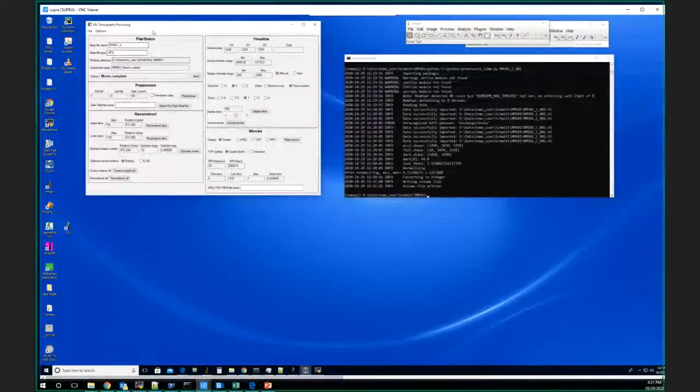In fact, for the reconstruction, I'm only using 8 cores. You don't need 48 cores, but you do need quite a bit of memory, because you're gonna have big arrays in memory and often multiple big arrays in memory at once.